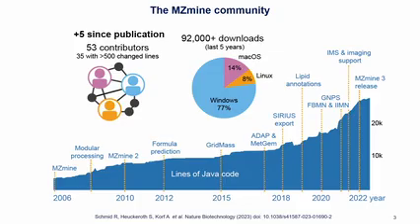So the software has now become more like a community project, although the core of the development is done in essentially two labs, in my lab and in Münster. There have been many contributions from all around the world. We have had almost 60 different developers joining the project. The project has over 92,000 downloads over the last 5 years. And on the timeline at the bottom, you can see the number of lines of code increasing over time with the introduction of different modules and functionalities.